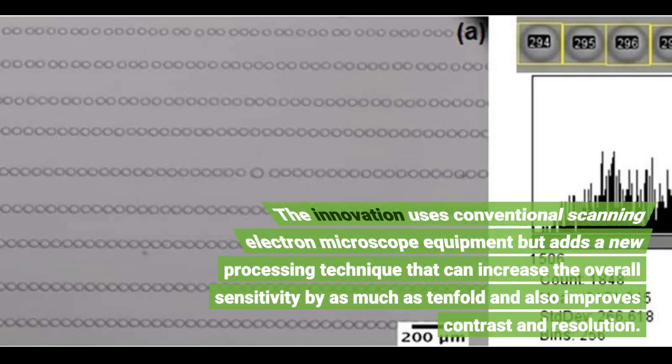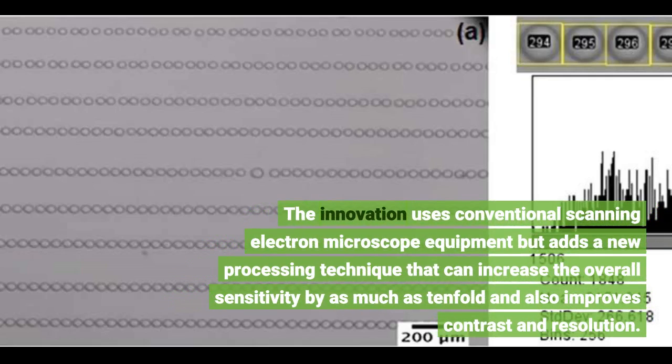The innovation uses conventional scanning electron microscope equipment but adds a new processing technique that can increase the overall sensitivity by as much as tenfold and also improves contrast and resolution.